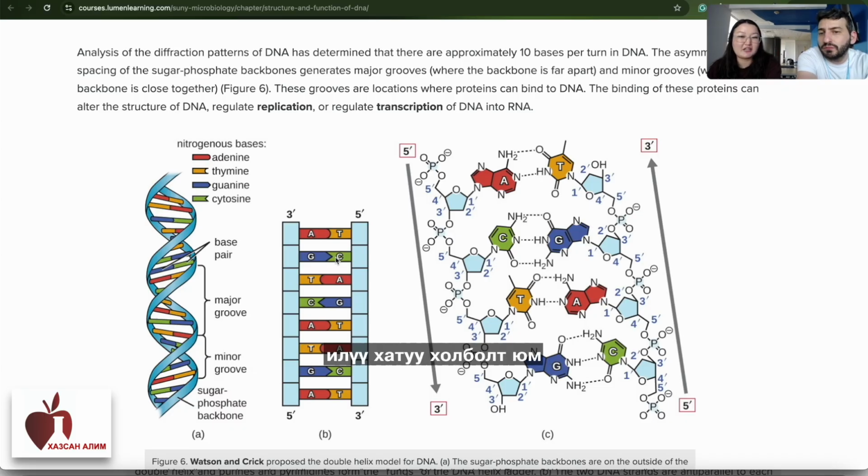That's why guanine-cytosine is a stricter bonding. So our primer should consist of 40 to 60% GC nucleotides, right? Exactly.